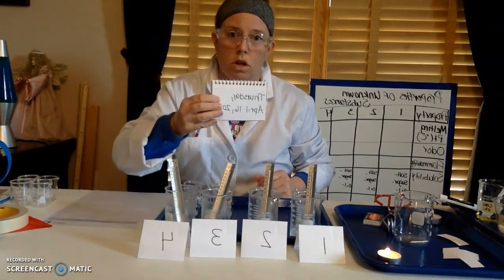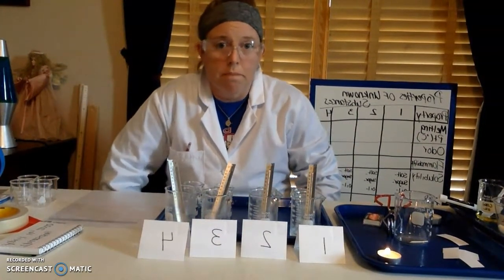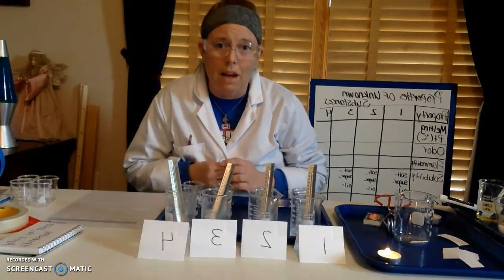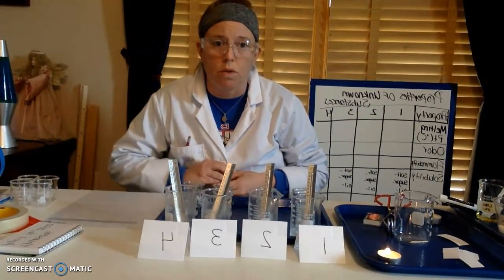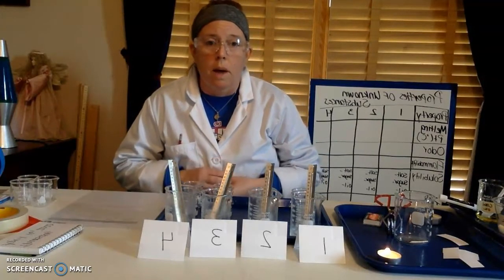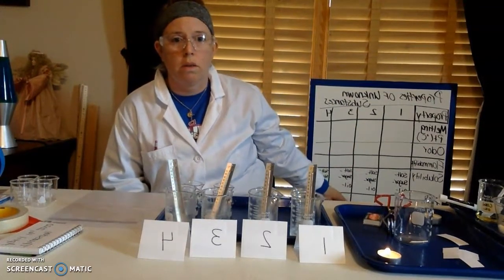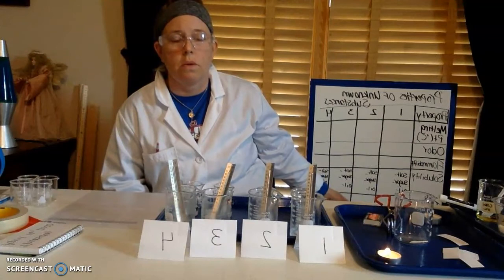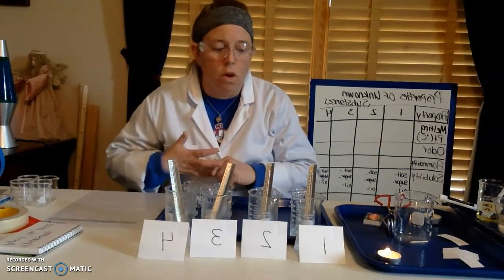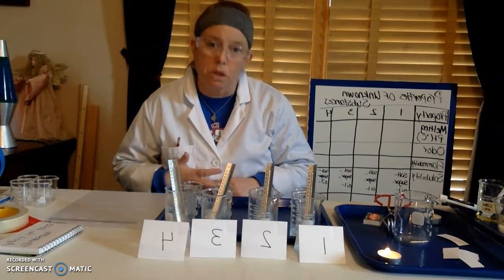So today, Thursday, April 16th, I'm going to be conducting the Identifying Liquids Lab. I'm going to follow the handout that I just posted in Google Classroom a few minutes ago, and I'm going to conduct these tests. Once you get a chance to look at the video, I will fill in the bottom portion of our data table that you can't see, the identity of these 4 liquids that I have in front of you today. Okay, so the first thing that we need to do is consider the melting point.